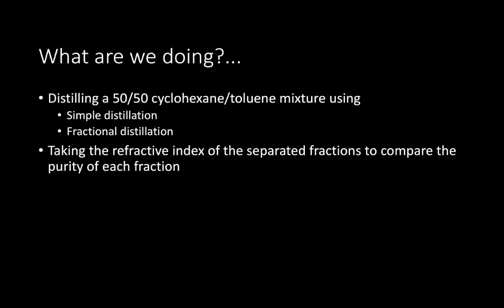Once you have completed your distillation, you'll take the refractive index of the separated fractions to compare the purity of each component that you have distilled. I'll discuss refractive index at the end of this pre-lab lecture.